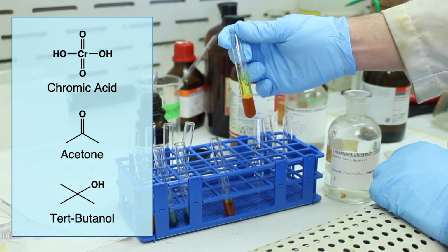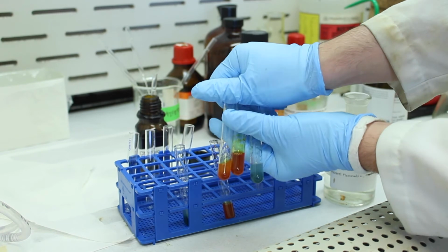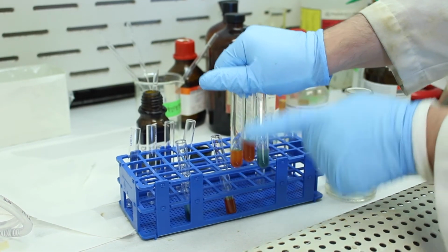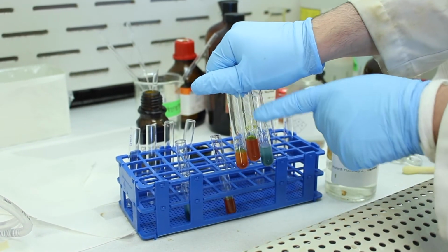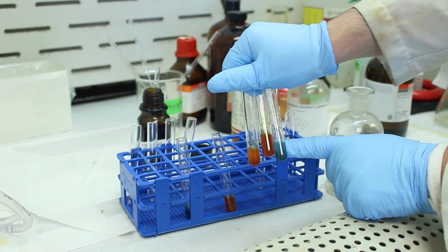Okay, it's still red. So if we compare it, on your left is the control, acetone and chromic acid. On the right is tert-butanol and chromic acid. No reaction as well. It looks pretty similar. A little bit darker, but it's pretty much the same. It's negligible. And then here we have a positive test result. This is what it would look like if it did react. So you can see it's grayish, bluish green.